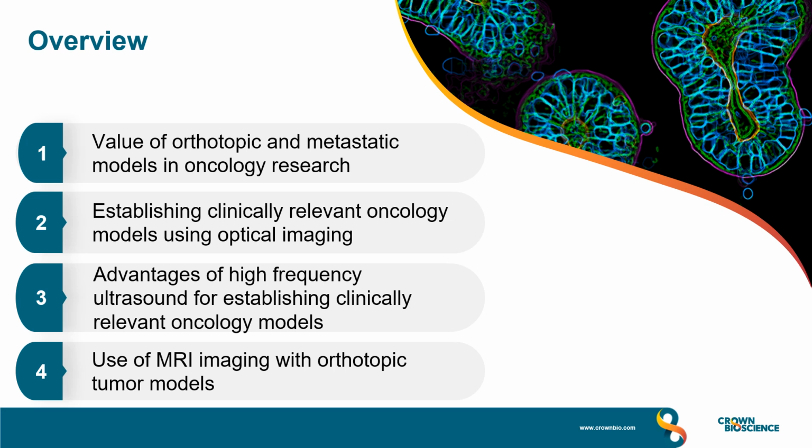The talk is going to cover the value of orthotopic and metastatic models in oncology research. It will discuss the establishment of clinically relevant oncology models using optical imaging. I will then discuss the advantages of using high-frequency ultrasound for establishing orthotopic cancer models. And in the final section, I'll discuss the use of MRI imaging with orthotopic tumor models.